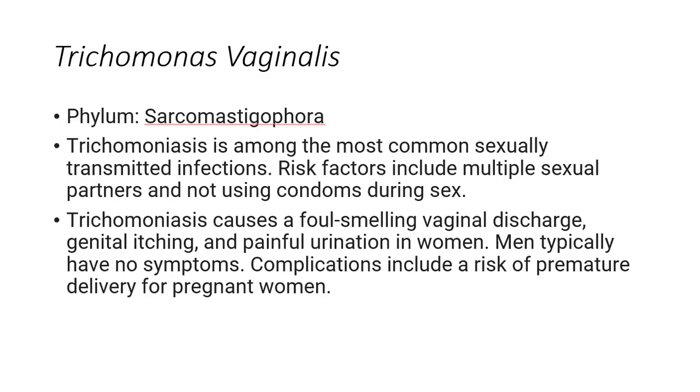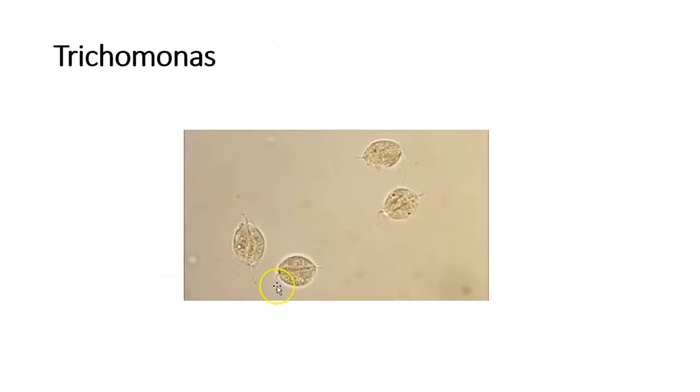Trichomonas, now we're going to a different phylum. We're out of Apicomplexa, and we're going into Sarcomastigophora. Aren't we having fun? These are guys that may move by one or more flagella. That's what differentiates them. And we've already talked about this, but there is that lovely little guy, and there is that lovely little flagella. You can see them. Same picture again.